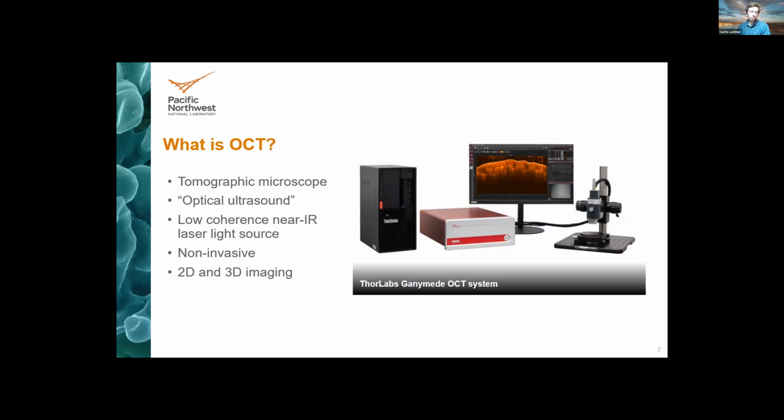So first, what is OCT? It's a tomographic microscope. It's often referred to as a kind of optical ultrasound, right? So it uses the same mechanism and produces images that honestly look a lot like an ultrasound you might have of a baby, right?